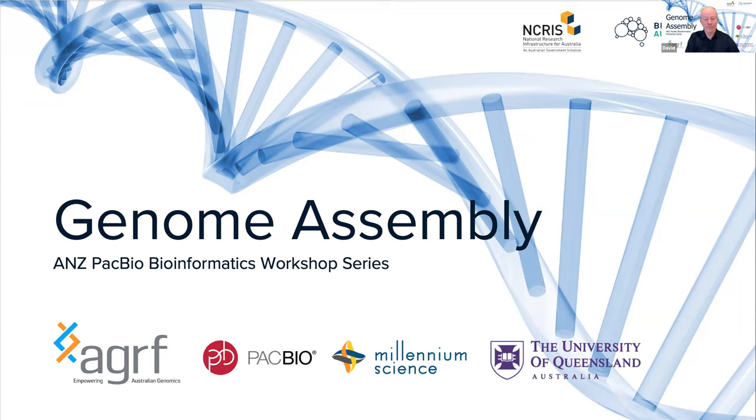My name is David Hawkes. I'm the Brisbane Site Manager at the Australian Genome Research Facility. And importantly for this talk, I manage PacBio long-read sequencing on the Sequel II instrument. PacBio long-read sequencing, particularly HiFi sequencing, has been an incredible tool for several areas in genomics research. Arguably, the area that has seen the most adoption is in the generation of reference genomes.